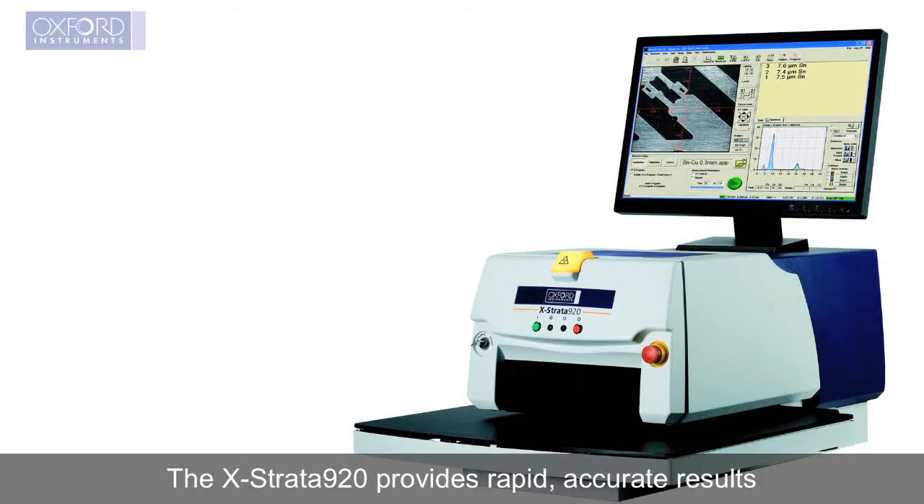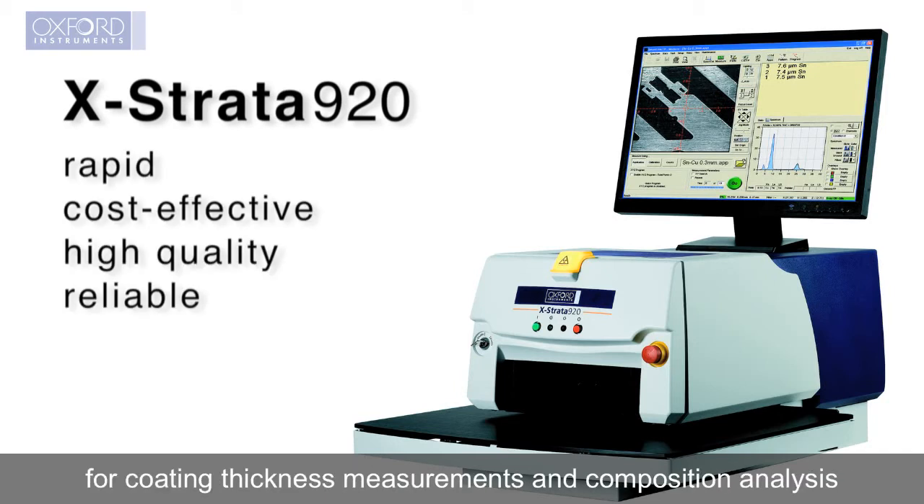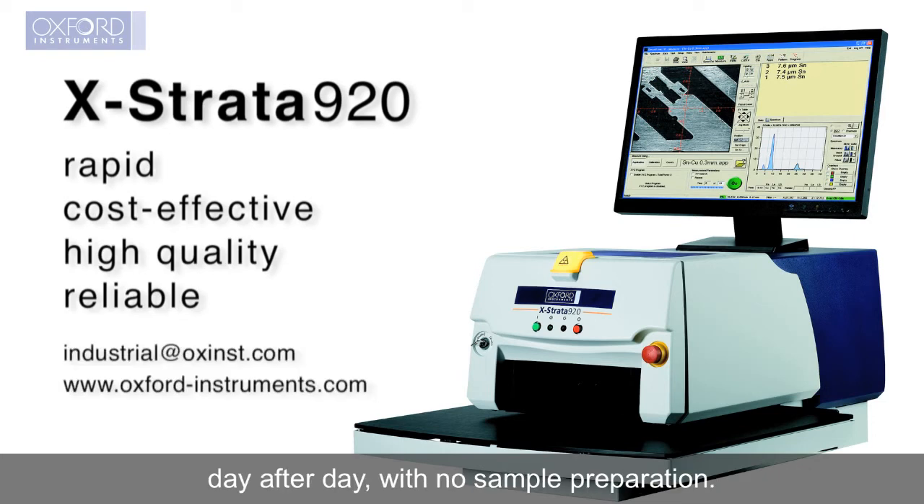The Xstrata 920 provides rapid, accurate results for coating thickness measurements and composition analysis, day after day, with no sample preparation.